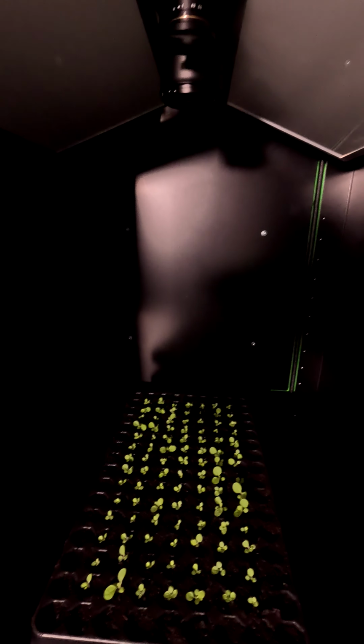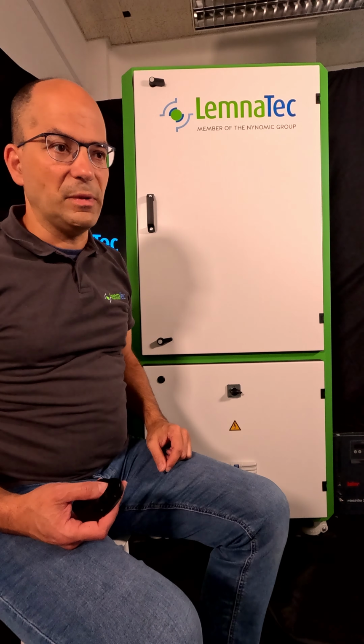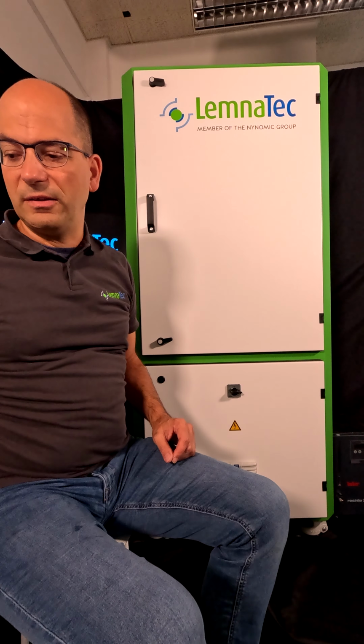The luminescence imaging with the high sensitivity camera of course does not require illumination because there the light is directly emitted from the sample. To record luminescence, of course we need to close again the door. As mentioned, bioluminescence can only be imaged when it is completely dark and external light is excluded. Now the samples are in the cabinet and we can use the cameras for image recording.